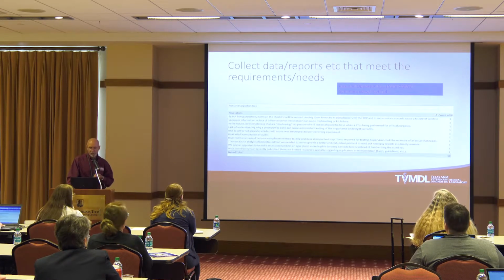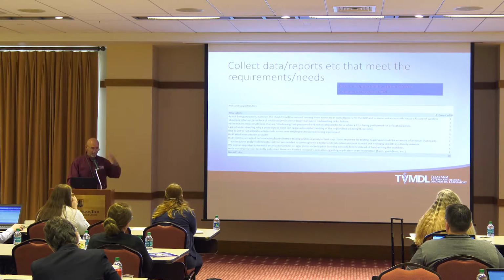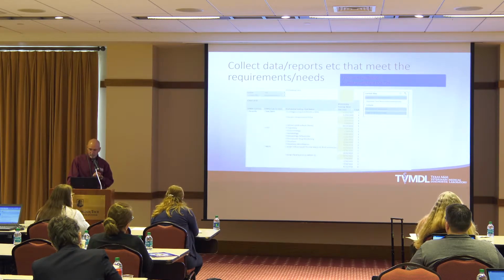Risk and opportunities. So these particular risk and opportunities, we started capturing them in Qualtrax through our corrective action process. So in the workflow, we've added a field for our risk and opportunities. And this is summarized for the management review. We just run a report, summarize it, and here are all the ones that we want to consider during the management review and what do we want to do about them, if anything.